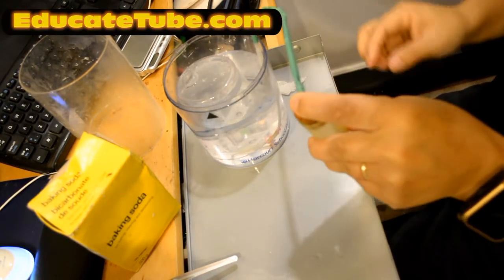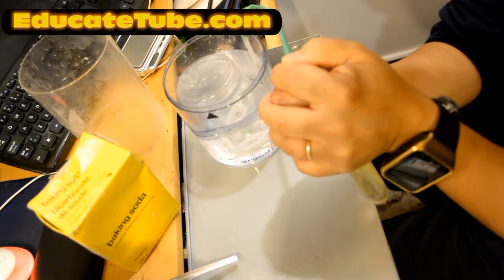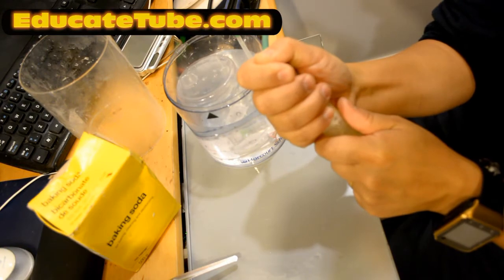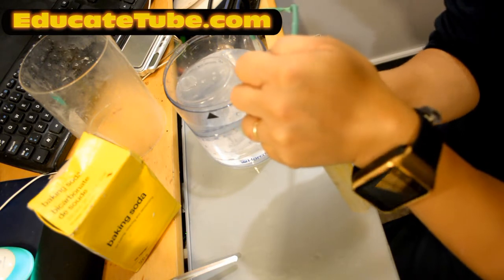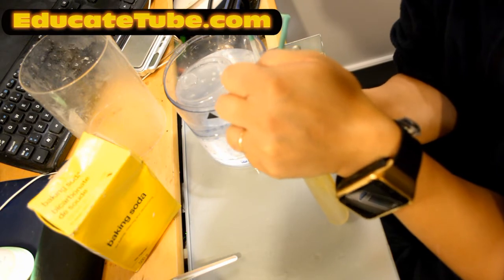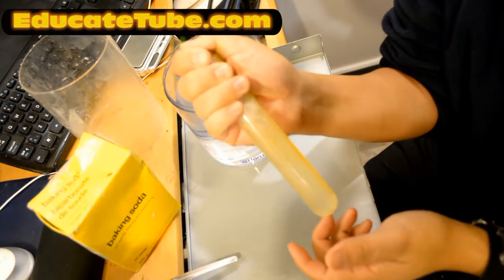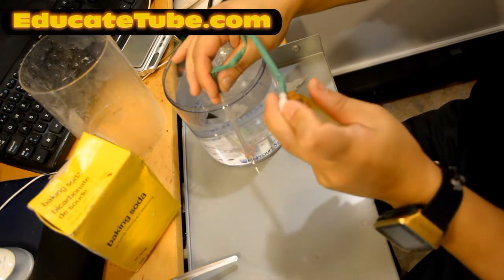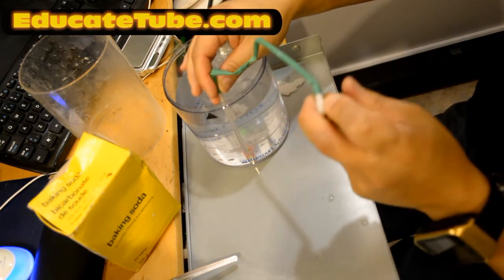You see that? Wow. I could feel that there is some hole. There's something that's escaping from this stopper. It's not a rubber stopper. I should use a rubber stopper, but I'm gonna close it to allow it to only go one way. Okay. Oh, there's gas escaping, guys. Need to use a rubber cork.